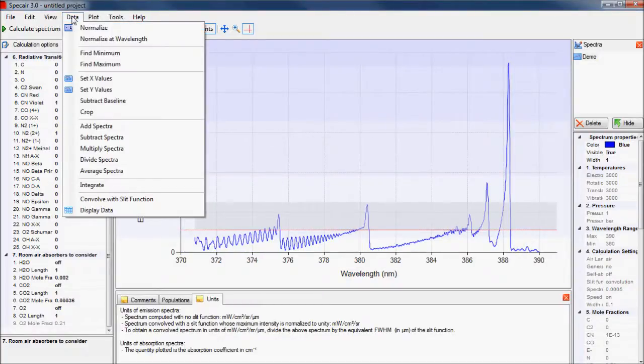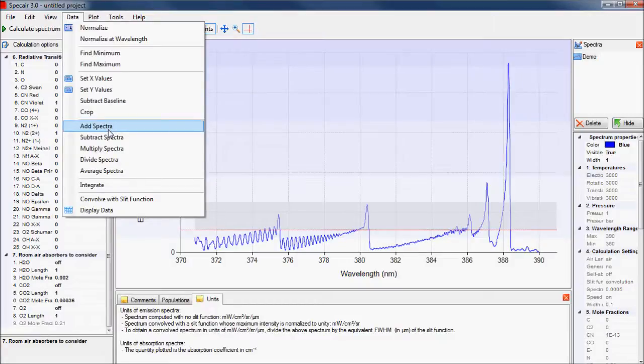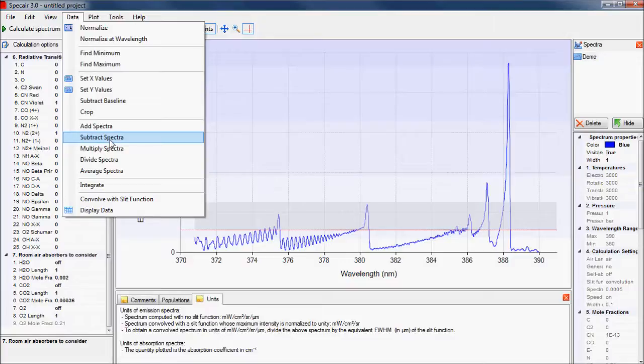By adding spectra, we can combine contributions from several transitions after the fact, and by subtracting one spectrum from another, it is possible to discover minor underlying features.